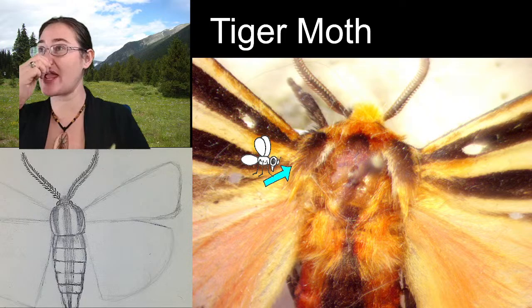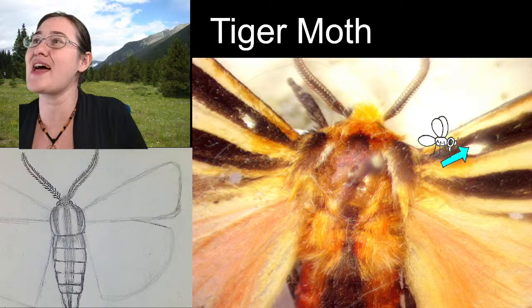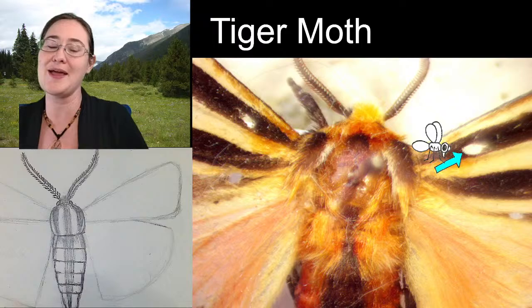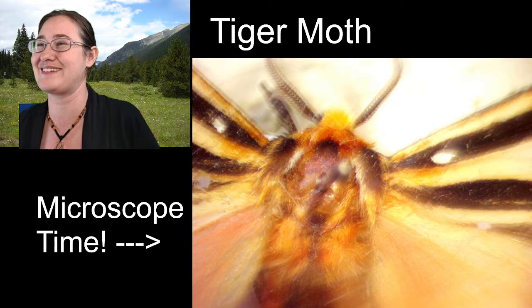Funny enough, this specimen was collected in 2010, back when I was just starting to learn how to really pin and organize a collection. And so I used a pin that was just a little bit too large when I was spreading these wings. And so I poked these really big holes in the wings from spreading it. Nowadays, I know to use the thinnest pin possible so that the hole is not visible, or to use pinning forceps. Either of those methods won't put a giant hole through your wing. But back in the day, that's how I did it.